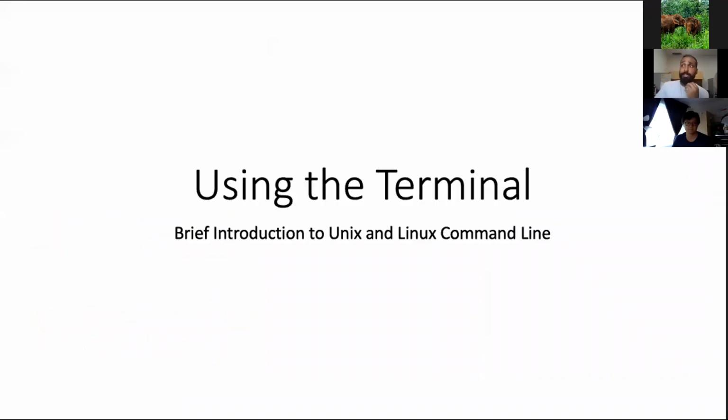So this tutorial focuses mostly on using Unix, so Mac OS or Linux command lines. If you're using a Windows machine, the commands will be a little different, but the theory remains the same. You can easily find the equivalent commands to those for Unix and Linux on Windows online, or you can install a Linux environment on your Windows machine with some know-how. This could be a little complicated, but it can be done.